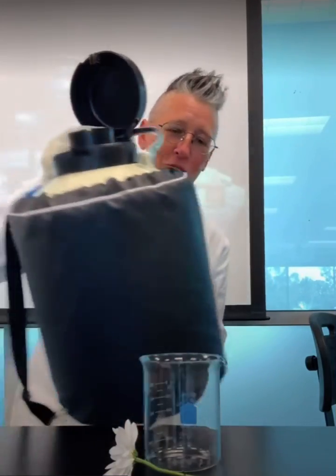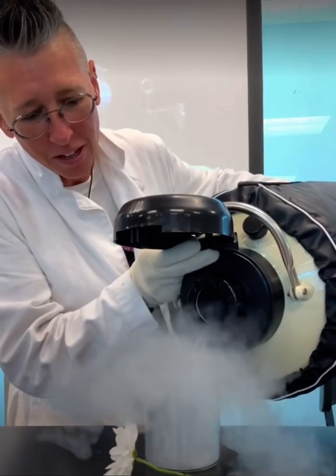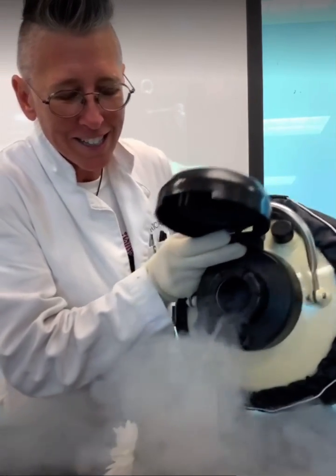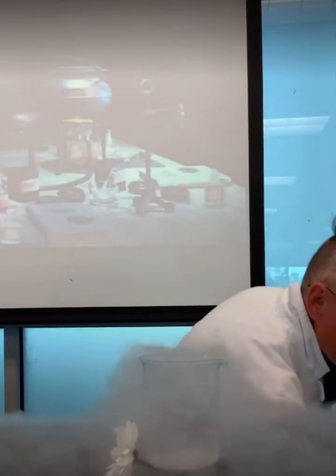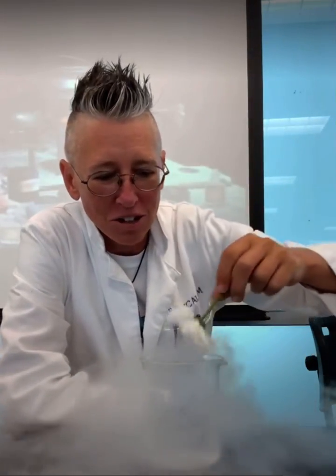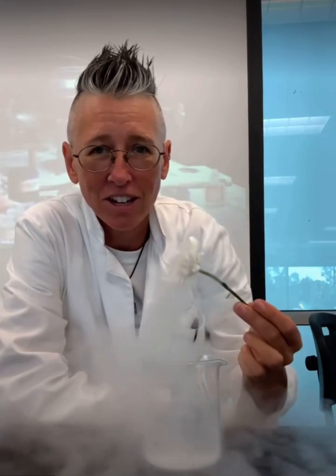I do often get comments from viewers about how I handle liquid nitrogen, mainly when I'm working with it. Why is it that I don't wear a glove? For example, if I put this flower into the liquid nitrogen, I actually feel safer not having a glove on.